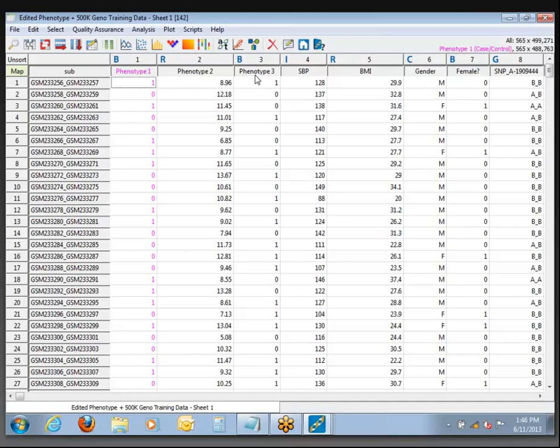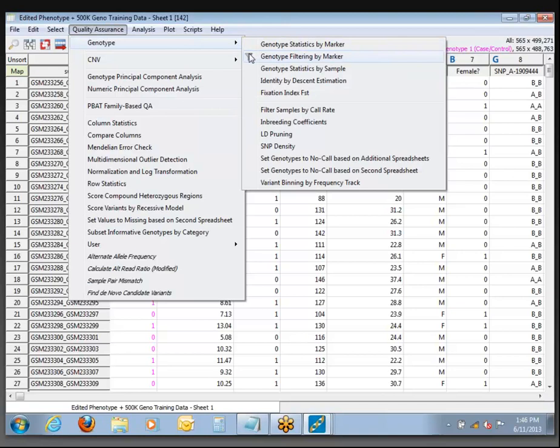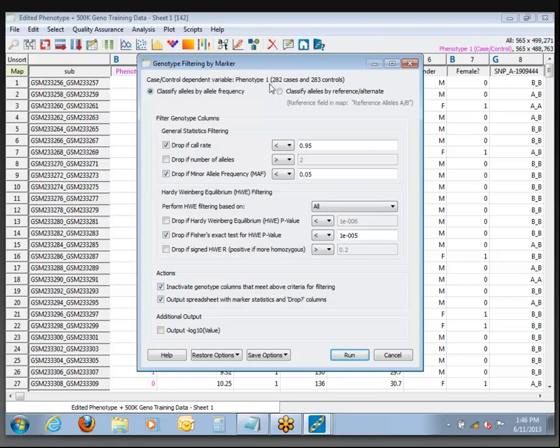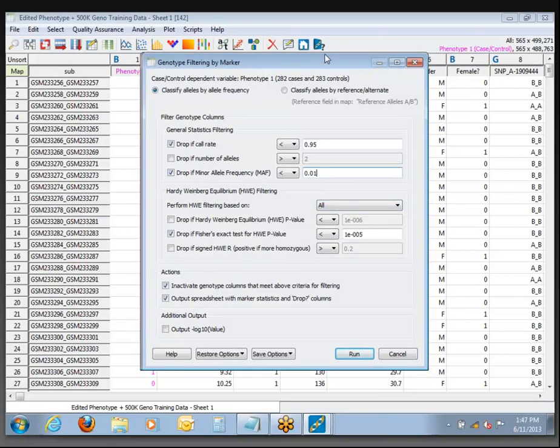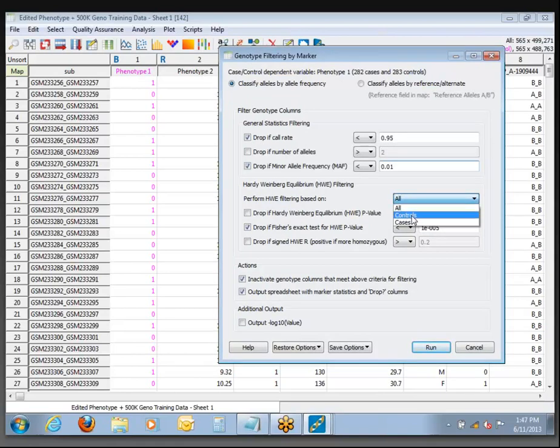Now we're ready to apply some basic filtering. The options are in Quality Assurance under Genotype Filtering by Marker — the same one we saw before with the little funnel icon. We'll keep it about the same: call rate at 95%, and for minor allele frequency this time we're going to be a little more inclusive and go down to 1%. Then on Hardy-Weinberg, the big difference is the variable for performing filtering — this was not active last time because we didn't have a dependent variable set. Since we do have a case-control variable set, we can choose to only use controls for calculating Hardy-Weinberg. We'll go ahead and use controls only, keep everything else like it is, and click Run.